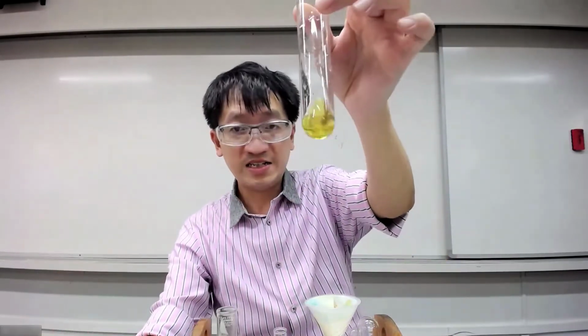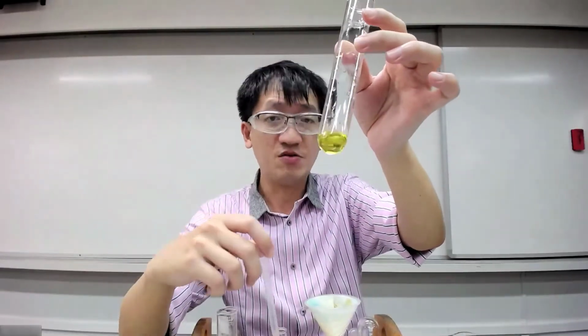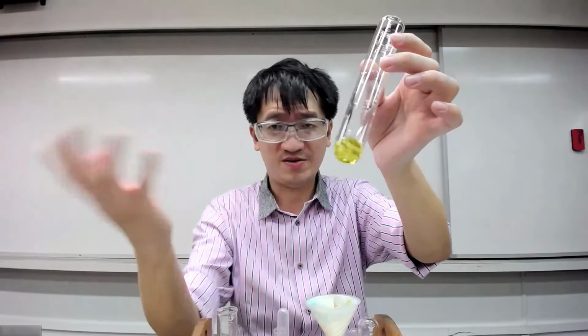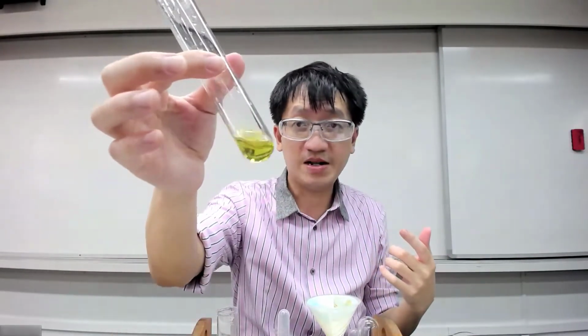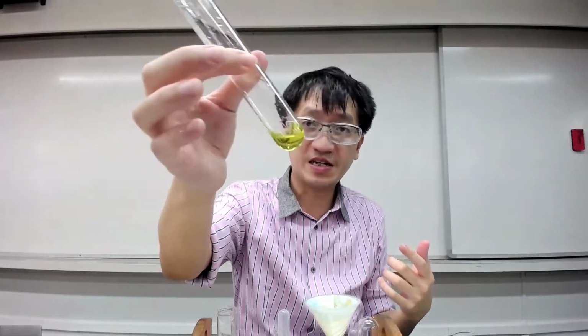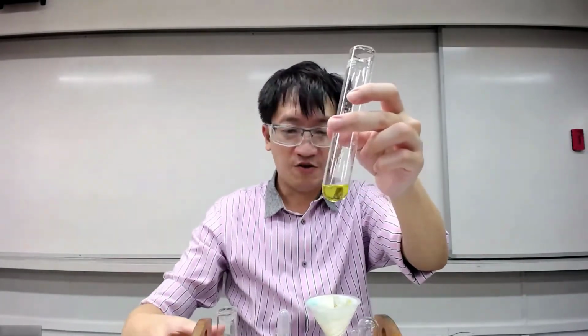Okay, you can see that this is not really very yellow, so it's probably contaminated with a little bit of copper too. Which sometimes you can't really run away from. But anyway, in this case, it's good enough for this purpose. So we're going to follow instructions.